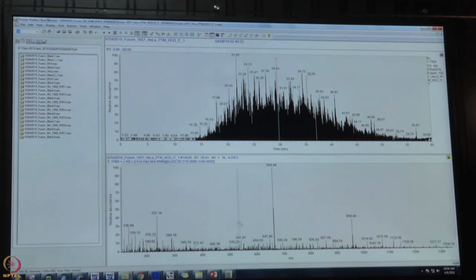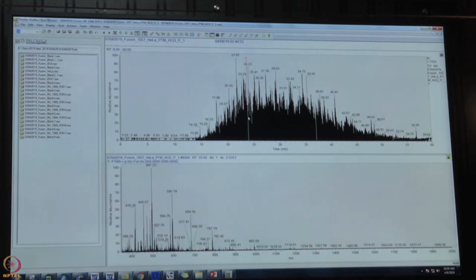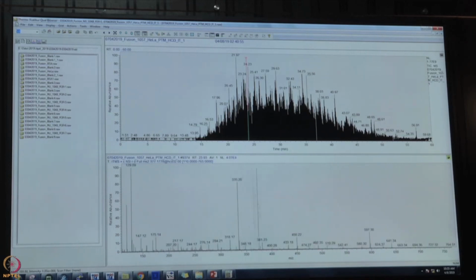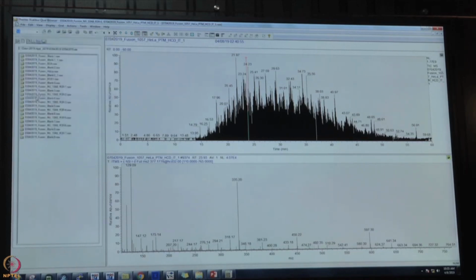So, the bottom panel shows the MS2 fragmentation pattern for the selected peak. So, if you can see here, this is the MS2 pattern for the selected peak. So, you see different fragments which have been generated, and also the signal is relatively less noisy. This helps in better interpretation of the data by the software. So, we now move to another chromatogram which is not that great.